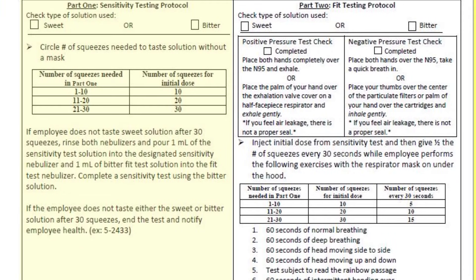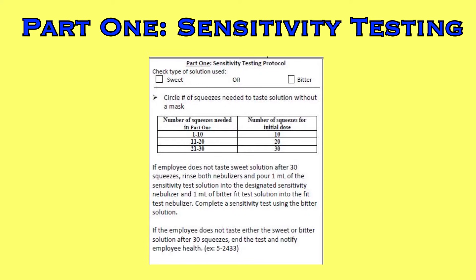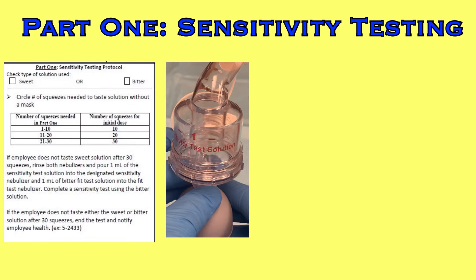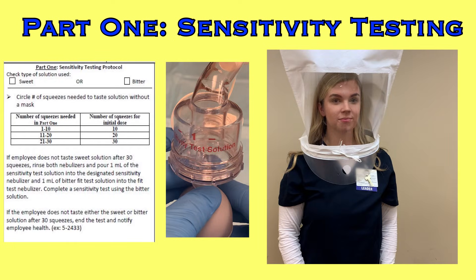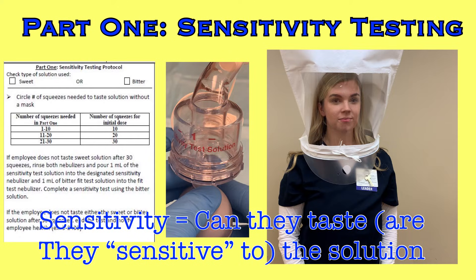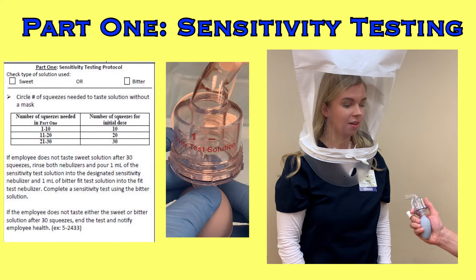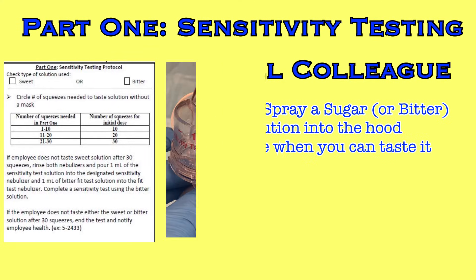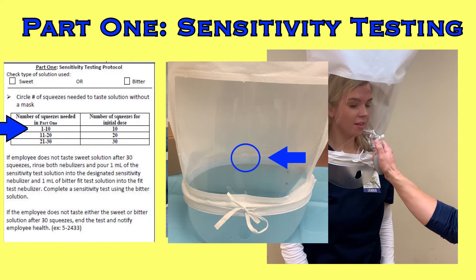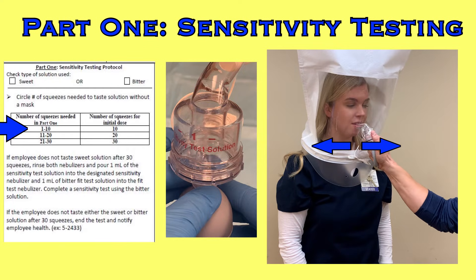Start at part one: test that the participant is sensitive to the solution, meaning they can taste it. We start with sweet. Since you're testing sensitivity, you'll need the nebulizer with the red sensitivity solution. Have the colleague place the hood over their head with no mask on. With their mouth open and tongue slightly out, have them breathe through their mouth. Tell them: 'I'm going to spray a sugar solution under this hood. I need you to tell me when you can taste it.' Then spray up to 10 sprays into the hood through the small hole in front of the person's face, angling the nebulizer to either side to avoid spraying mist directly into their eyes and face.